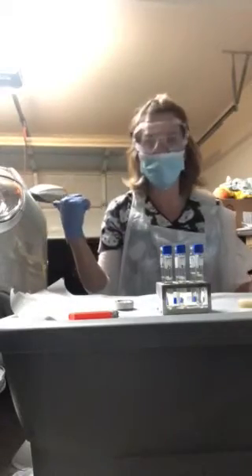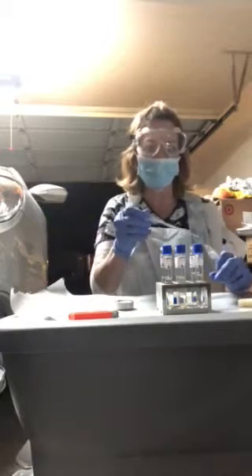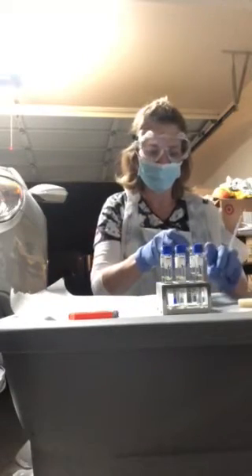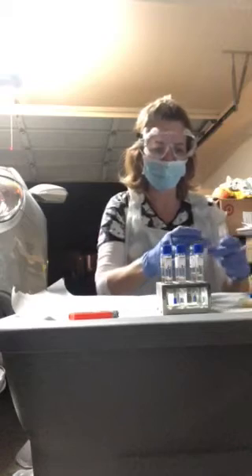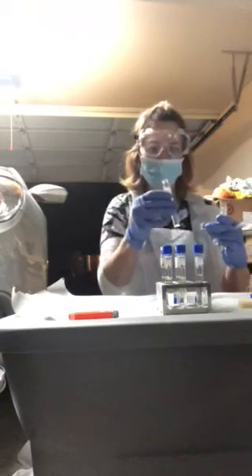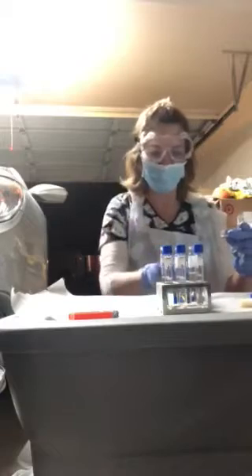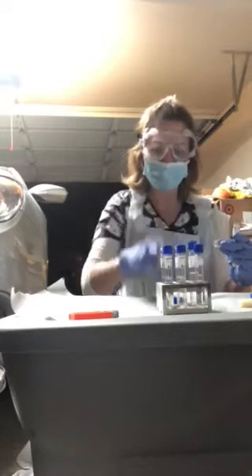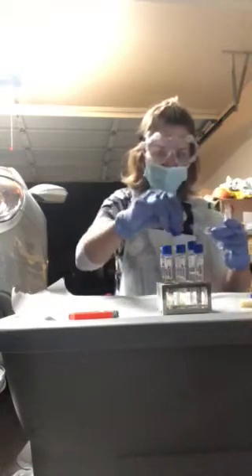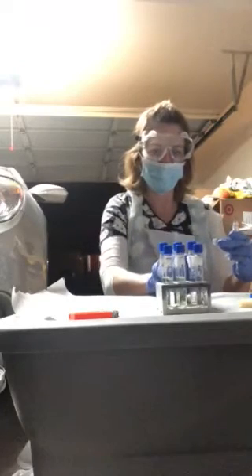I've had to start this video over twice because my family keeps coming in and out of the garage. I've already done my S. epidermidis, so I'm not going to do it all over again — my kids came home from baseball practice — so I'm just going to keep moving right along.